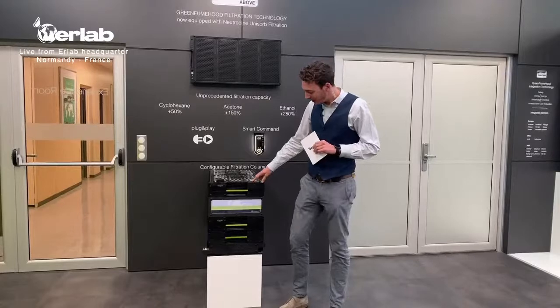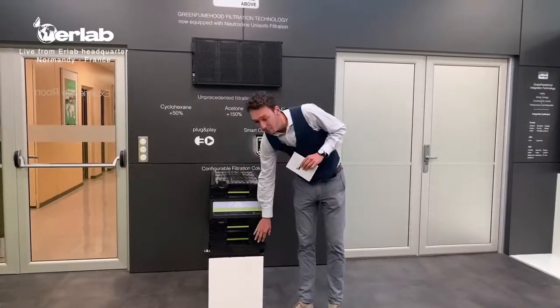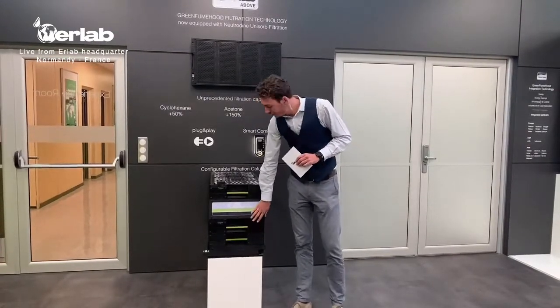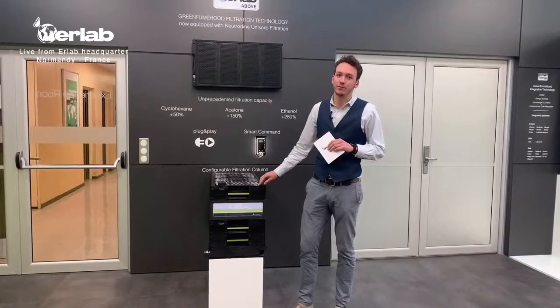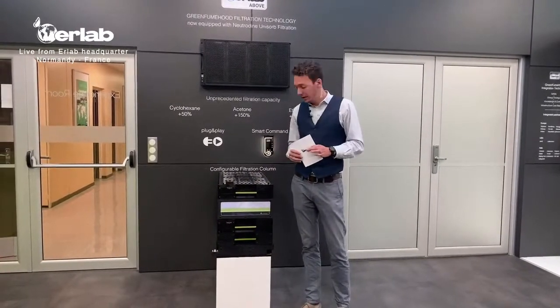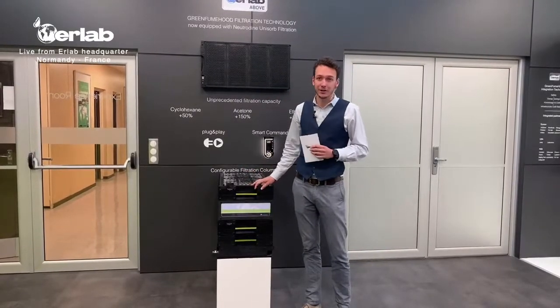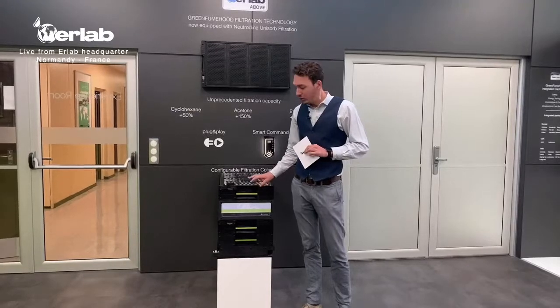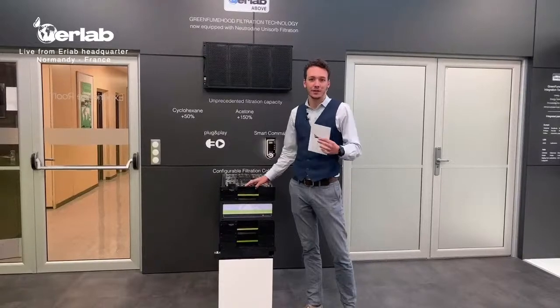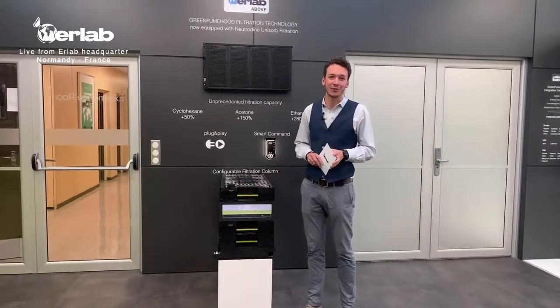So what you see here, we have 3 layers of filters. We start with a HEPA filter, which is for powders mainly, and then we have a carbon filter and a backup carbon filter. So this is really a configuration when you work with powders, but also with liquids, to be protected for all the manipulations that you're going to do in the fume hood. What's happening afterwards? You bring this one down, and a new one comes on top, which is the revolving system to make sure that you're kept safe at all times.